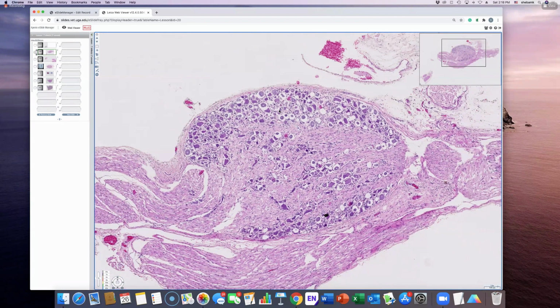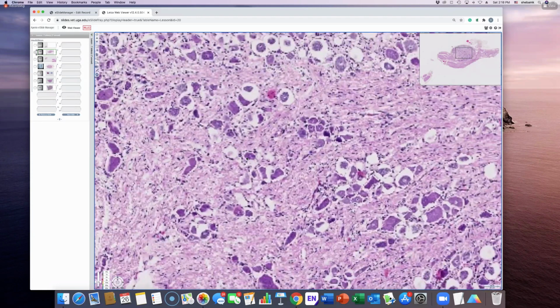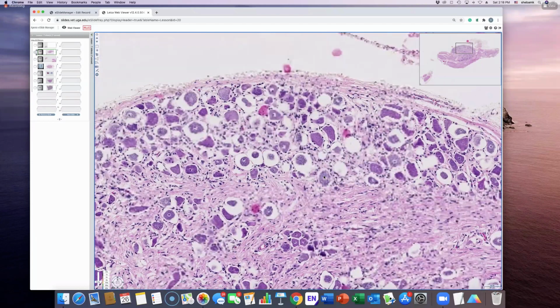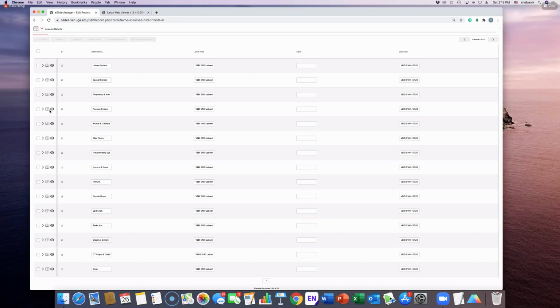So the nerve cell bodies are here, right? Let's go take a look. These are the nerve cell bodies, okay? And they have a nucleus, a nucleolus that is visible sometimes. Very nice nucleolus there. Okay, and these are all glial cells. We call them satellite cells, around these neuronal cell bodies. Okay, what else do we have? We did that, we did that. So that is it for the nervous system.